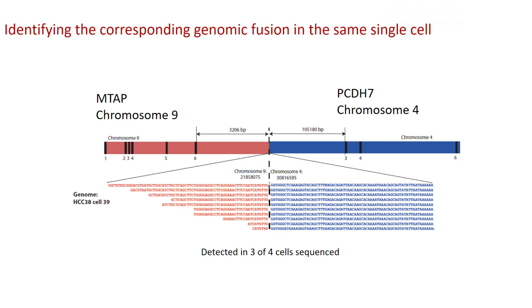And I think the reason the long-range PCRs weren't working is because the distance is very, very far, actually surprisingly far. It's 100,000 base pairs or more between the two exons in terms of the genome fusion. So it's really a very strange transcript. But at least we found something that resembles the fusion site that links these two exons.